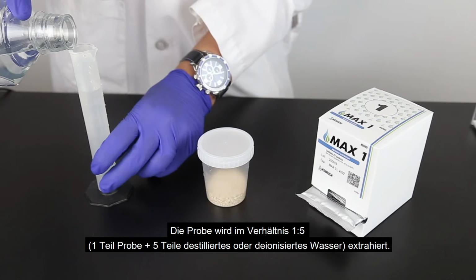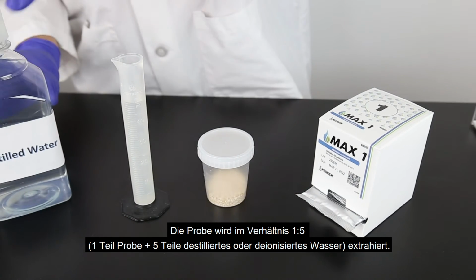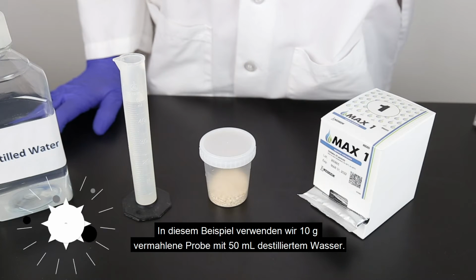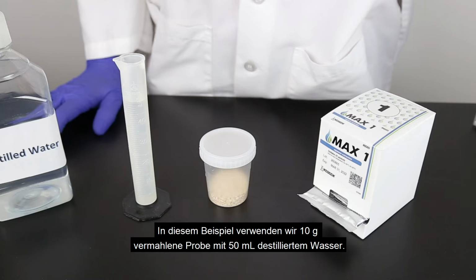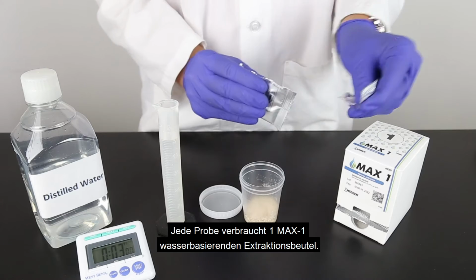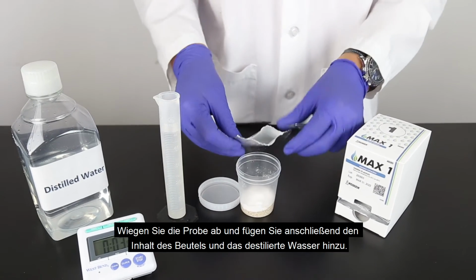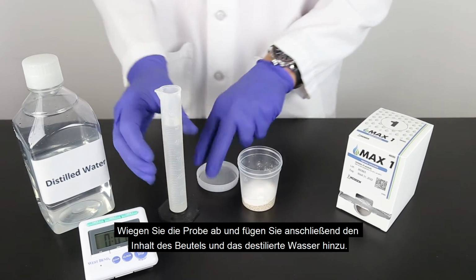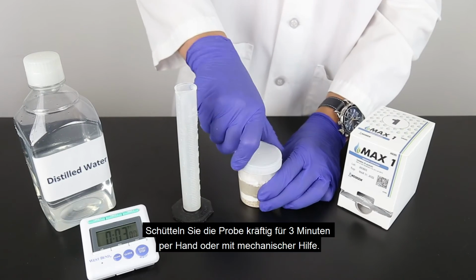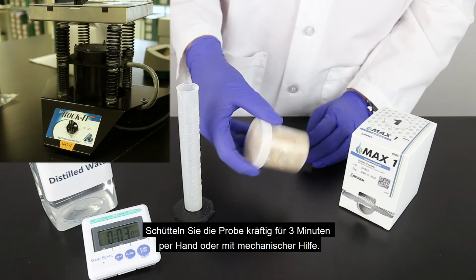The sample is extracted with a ratio of 1 part sample to 5 parts of distilled or deionized water. For this example, we're using 10 grams of ground sample with 50 milliliters of distilled water. Each sample uses 1 Max 1 aqueous extraction packet. Weigh out the sample, add the Max 1 packet, then add the distilled water. Vigorously shake for 3 minutes using hand or mechanical means.